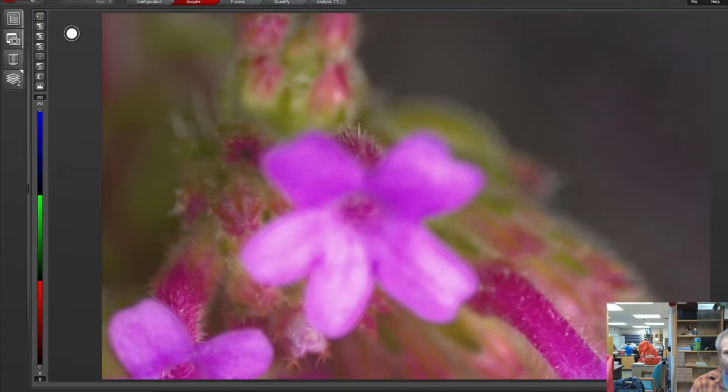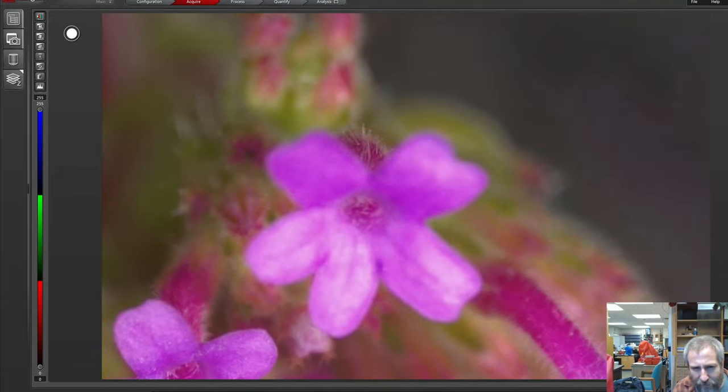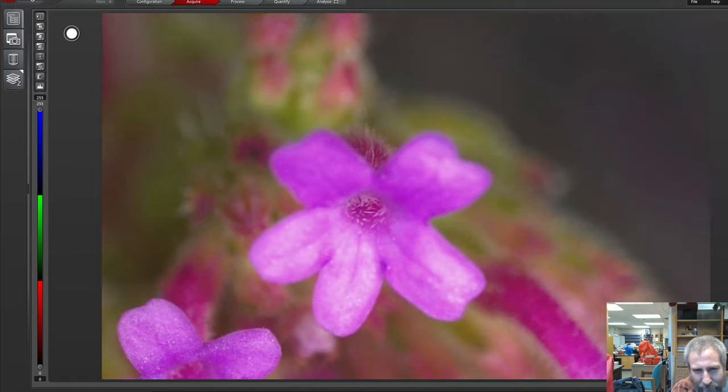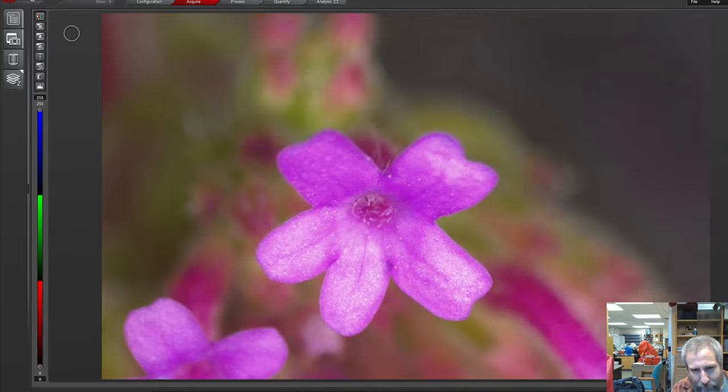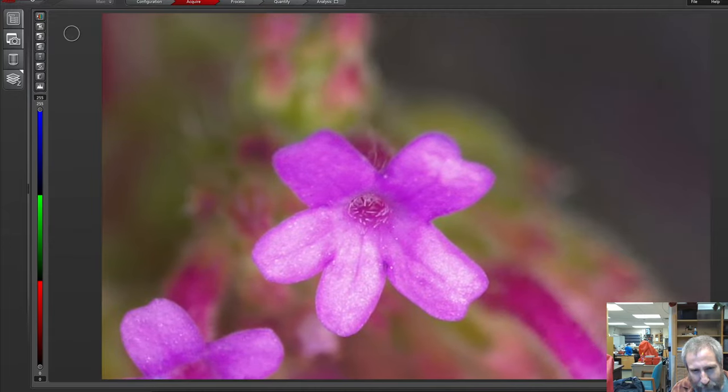But there we're looking inside. There we go. We're looking inside the, you know, where the sexy bits are on the flower. And we'll come out to the actual petals. We can focus to the point where we can see the petals. But see right there, that sort of hairy bits.